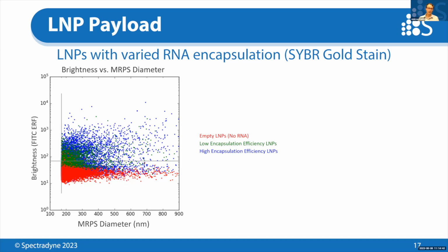Just as a side note, the only way that people generally have to evaluate how much RNA gets taken up into the LNPs is to do a bulk analysis, like a RiboGreen assay of the free RNA in solution after the encapsulation step. So you know how much RNA went in, you know how much is left over in solution that did not get encapsulated from the RiboGreen assay, and then we assume that the rest of the RNA goes into particles. But we don't know anything about the uptake, the size distribution of the particles that took up RNA, and how much RNA is in each particle, right? That's where the ARC comes in here.